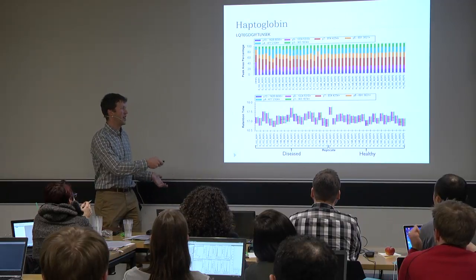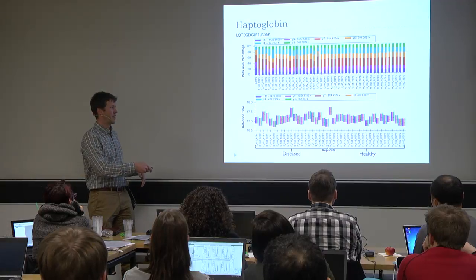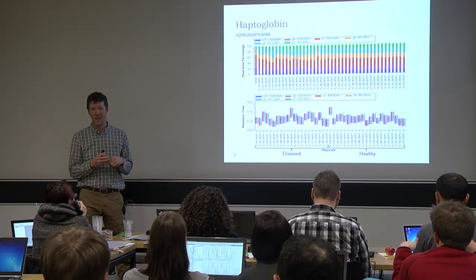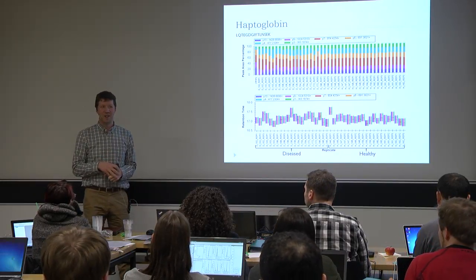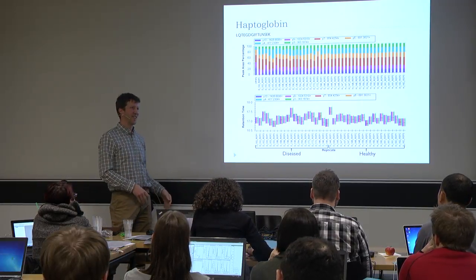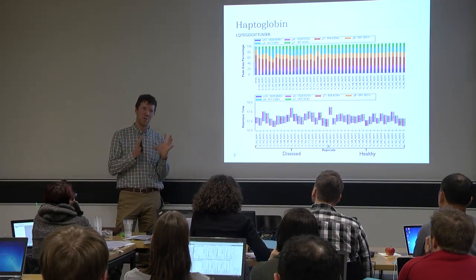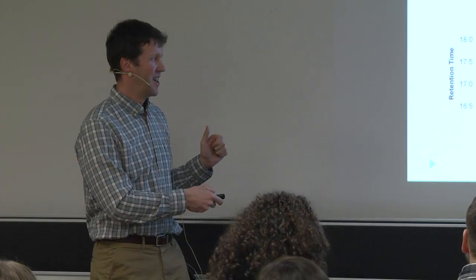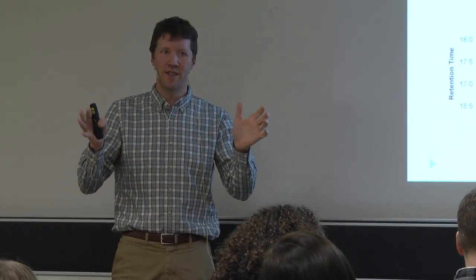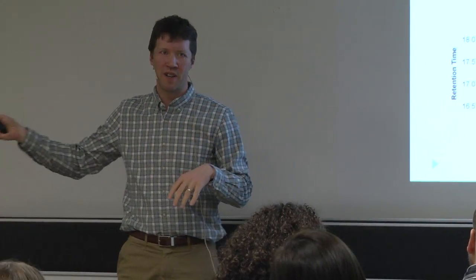Is this a good order? Would this be a great order to measure my replicates in? All the disease first, and then all the healthy second, and every subject grouped together. Okay. Scrambled maybe? Yeah, there should definitely be some randomization, and that's something that when we have Olga Vitek here tomorrow, she's going to try to hammer into you good and hard. The other thing is we'd like to see cycles so that we're doing some blocking. We would like to measure all of our subjects once, and then measure all the subjects again, and then probably randomize within those groupings.